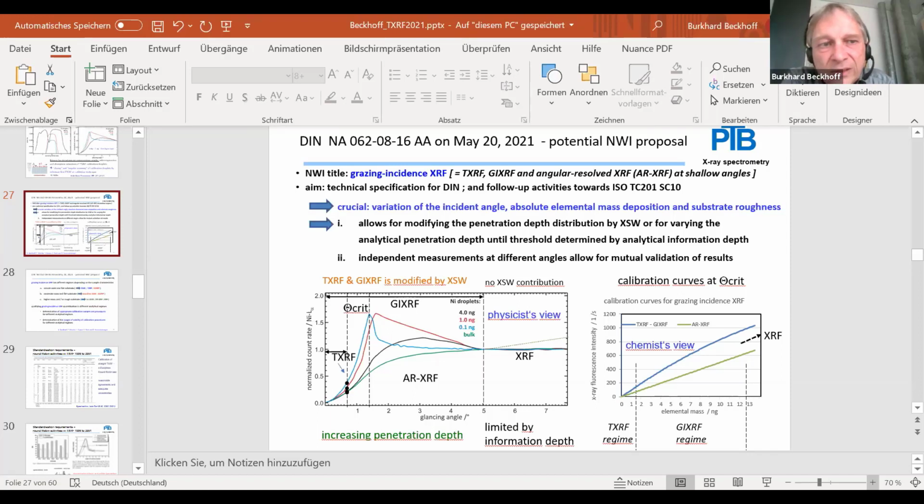And the question is, that depends on the partner if one should include this. And it's not only aerosols. This might be also for other environmental applications where you have particles that one has to find a way to deal with, monodisperse or polydisperse particles. And I think in the shape, you can only see a very monodispersed distribution of very small particles. This would be my expectation.